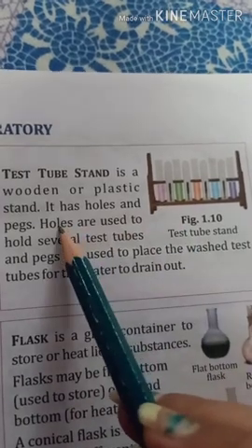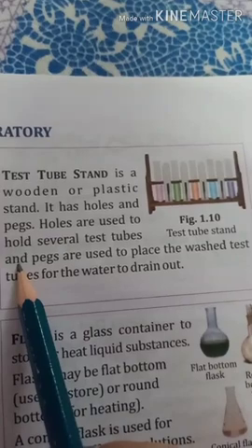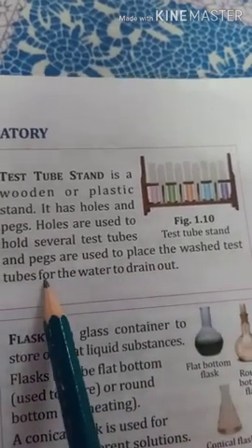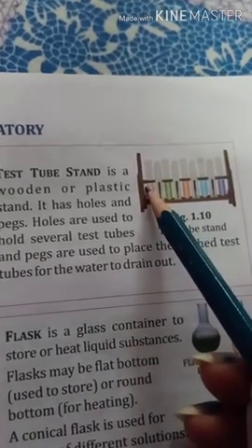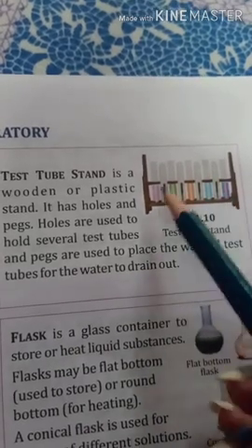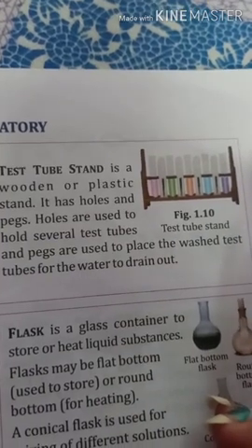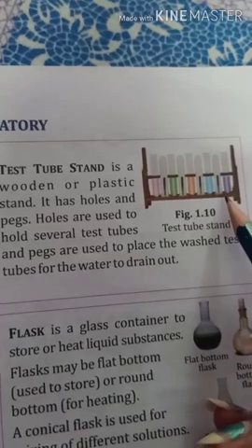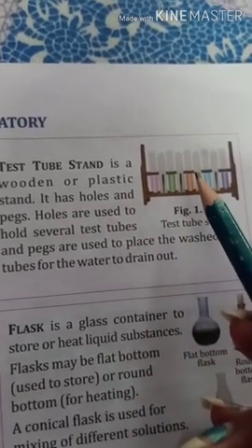So, these holes are used to hold several test tubes, and pegs are used to place the washed test tube for the water to drain out. So, here we have a number of holes, and these holes are used to hold a number of test tubes in this test tube stand. And here we have pegs. These pegs are used to place the washed test tube for the water to drain out.